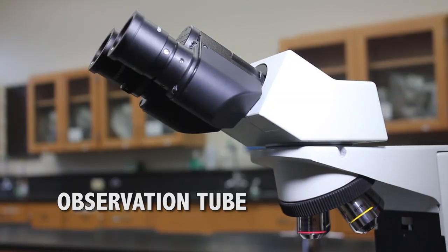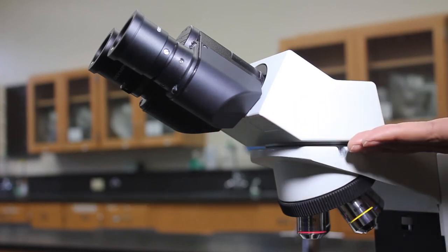Observation tube. This should be fixed in the forward position. If it is not, alert your instructor because rotation may damage the microscope.